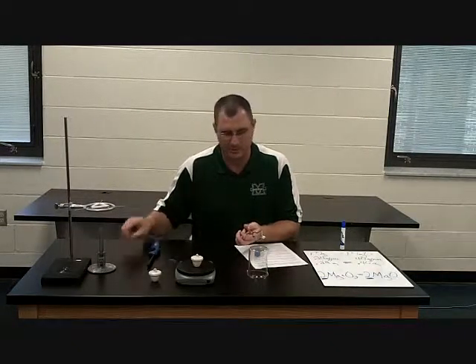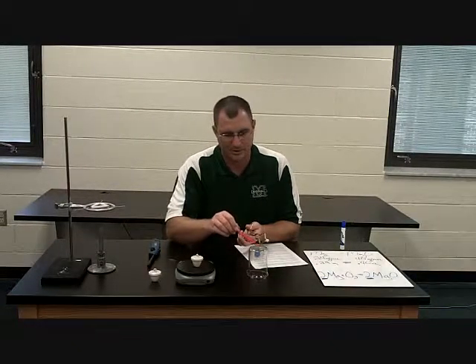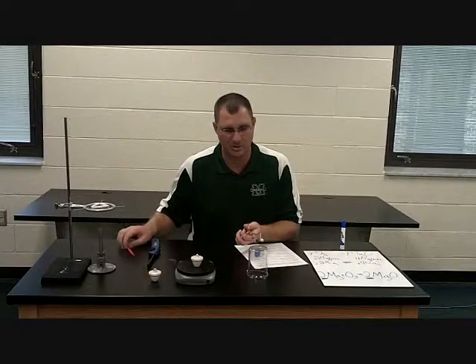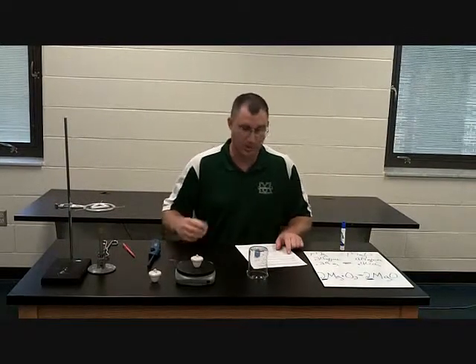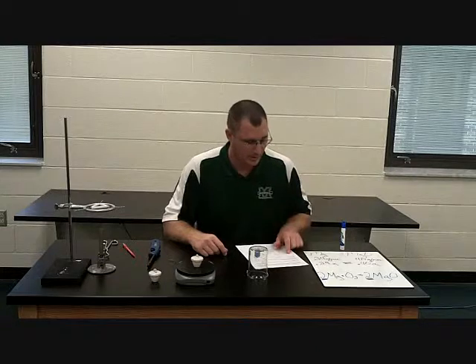And here's what's neat. Look at this stuff when we're done. It's a white powdery substance. So if I tap it, of course it doesn't do anything, there we go. You can see that white powder fall down. All right, so that's a totally different substance altogether. Now, when I think of qualitative properties of that product, I would just say it's white, it's powdery, would be about all I could really recognize.